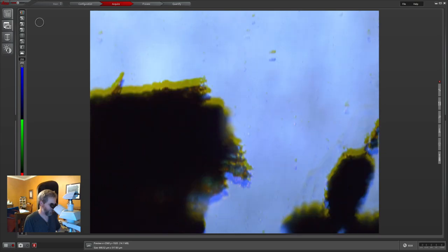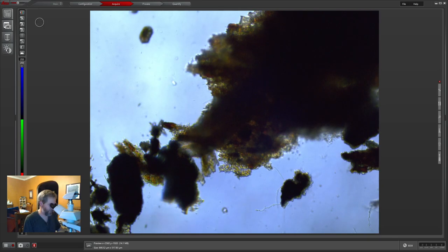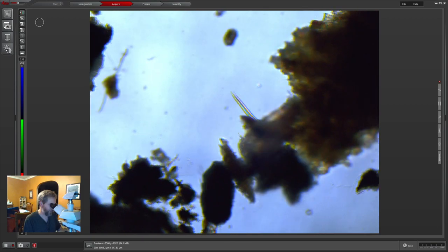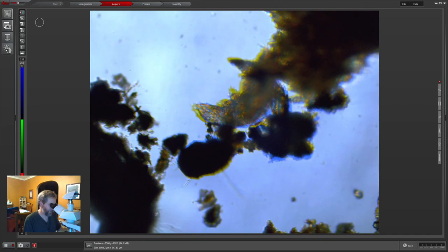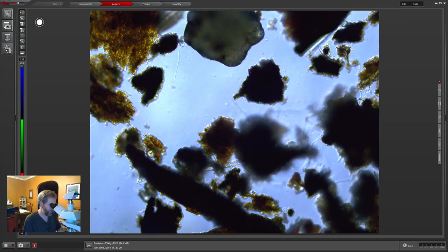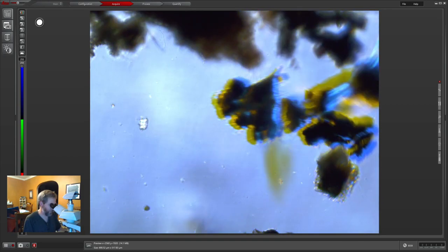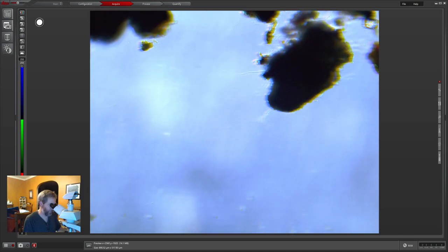He's managed to move around — coming out the bottom side of that stack of junk, doing a little exploration. There's another nematode; this one's not quite as squirmy. There's a lot of worms. I saw a rotifer in here as well earlier. Oh, here it is — there's a little rotifer.